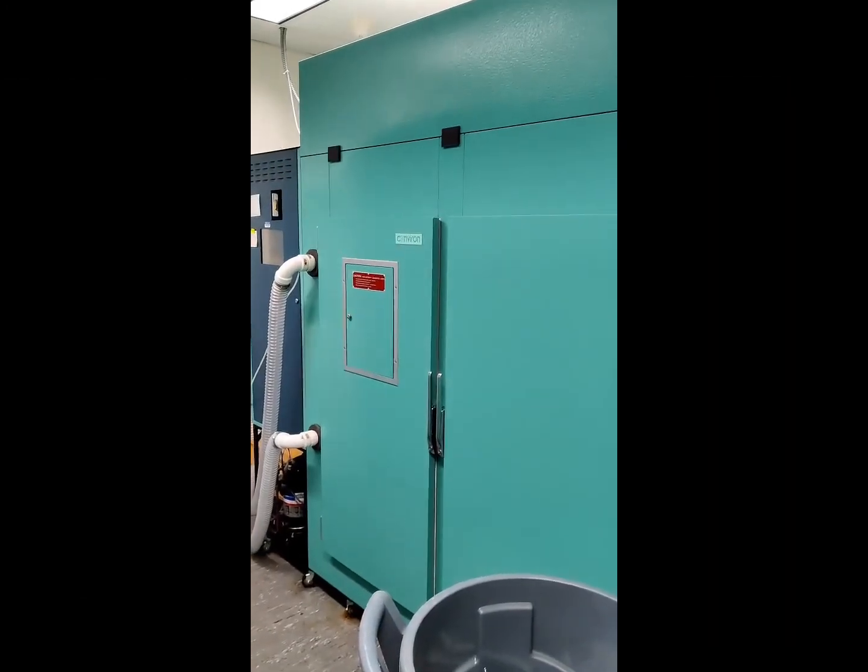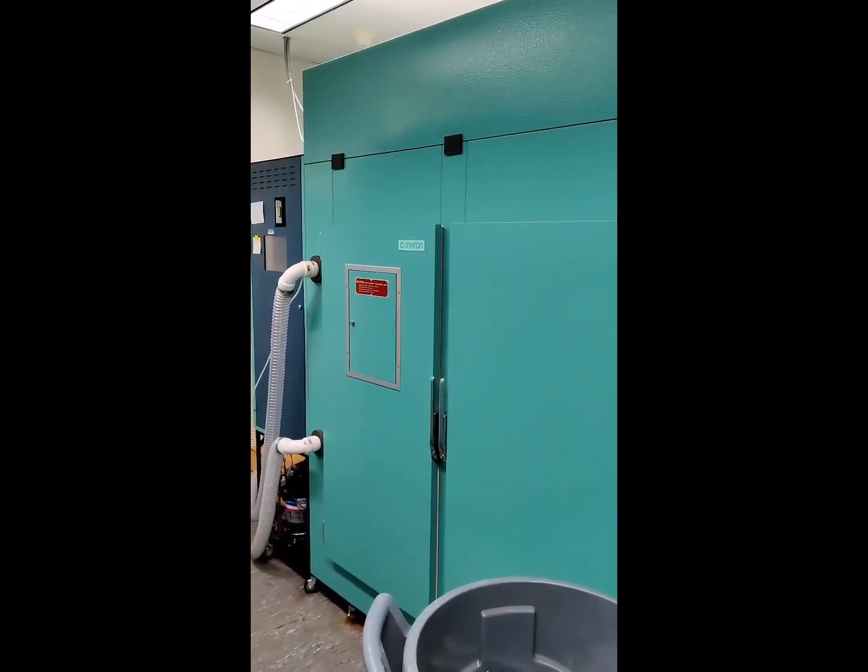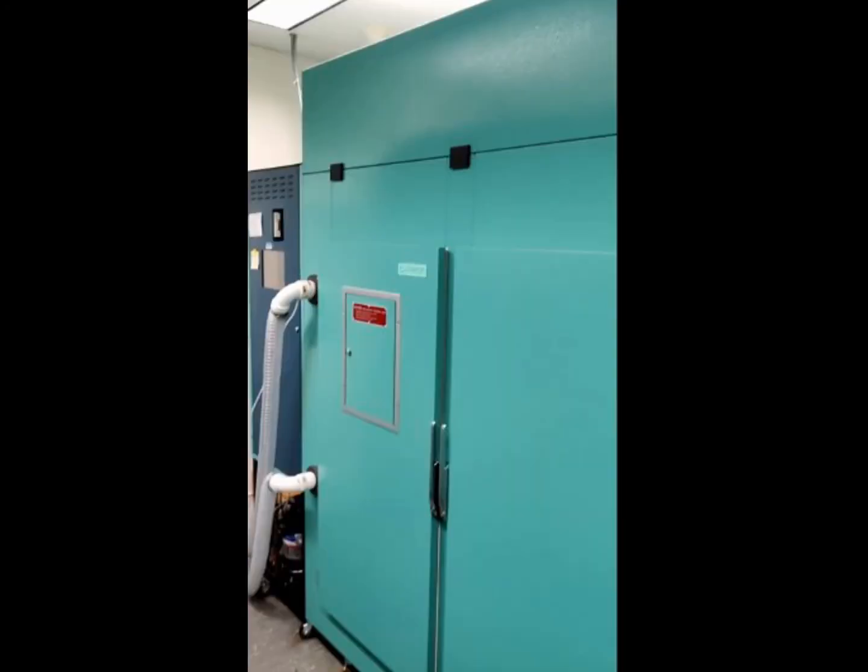So I did another sneaky sneak to get access to this big old thing. The main cabin of this machine, which is the turquoise section, is about 10 feet tall and 7 feet wide, and it has enough space inside to grow plants that are 3.5 feet tall. The plants are stored in the two main compartment doors in the front, which are firmly kept shut to preserve the exact plant environment inside.